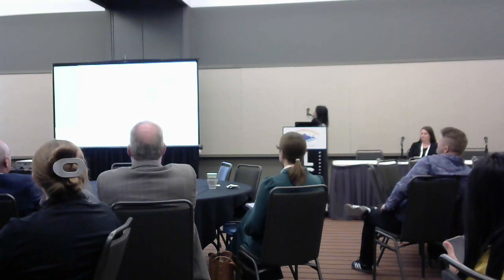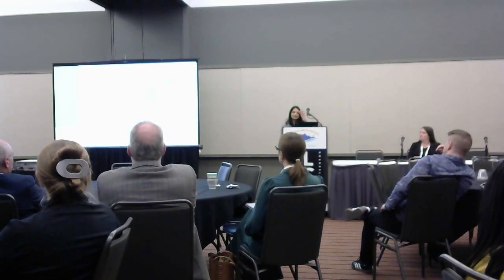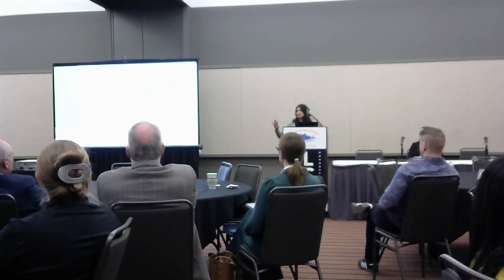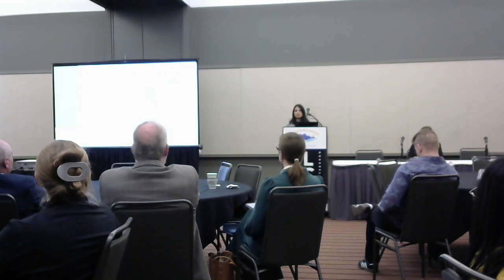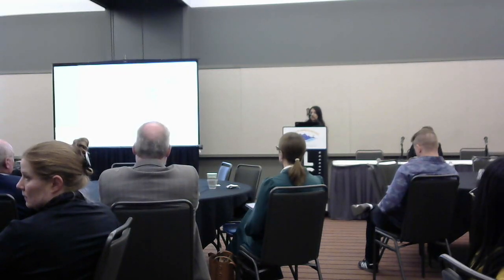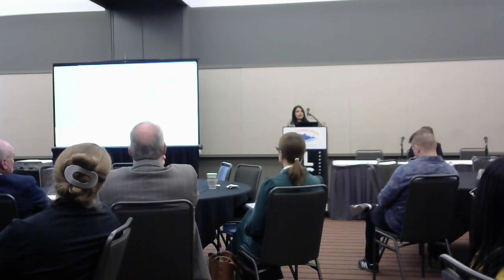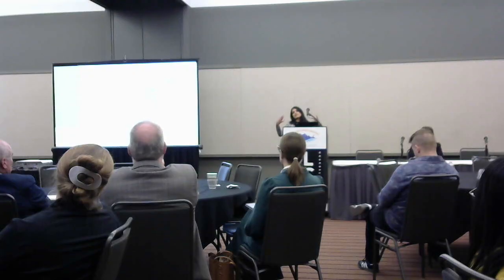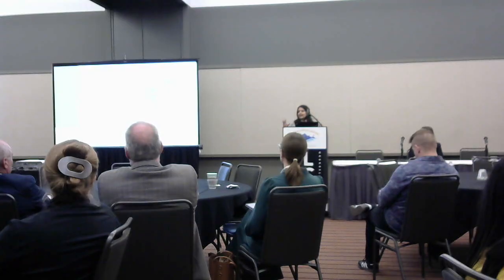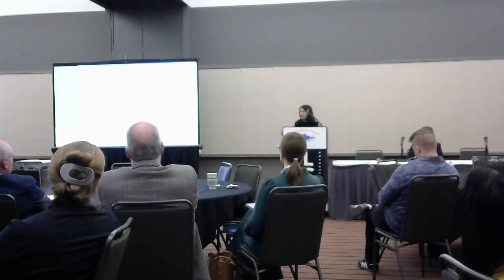And what does the HPC workflow look like? So at Seattle Children's, if you are a new user to HPC, we first request an account so you can access this resource. And there is an orientation and training provided by our HPC team to onboard you. Once this is done, you start by logging into one of these two login nodes. Whenever I say nodes, you can think of it as a computer within that cluster. These two login nodes are fully functional nodes, but we don't run any actual task on them. This is just used as a landing or launching pad.